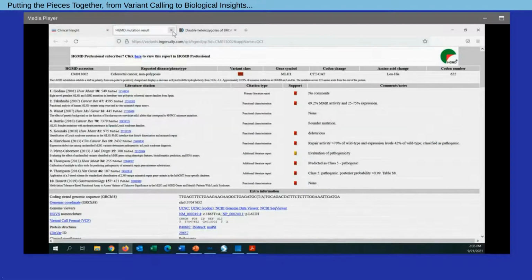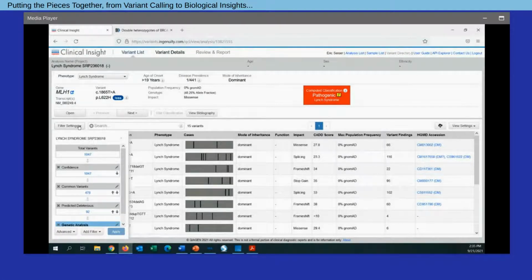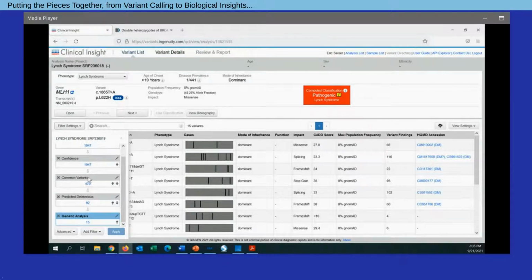So it's very flexible. But in the context of analyzing a cohort of samples, what might be relevant is to actually do some filtering steps. So we have this customizable filtering cascade that will allow us to filter variants based on confidence, based on how common they are in the general population, characteristics related to the deleterious nature of a given variant, and also just characteristics on the cohort. So again, as I mentioned, I filtered this down to identify those variants that are pathogenic or likely pathogenic that show recurrence in at least 2 out of the 84 samples.